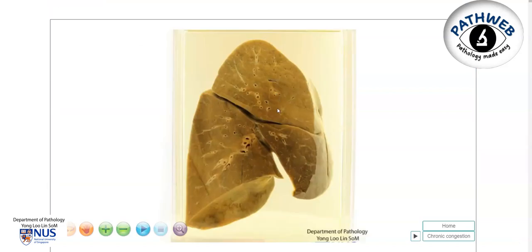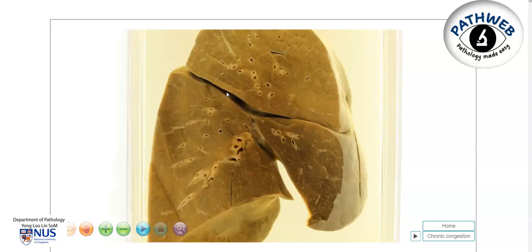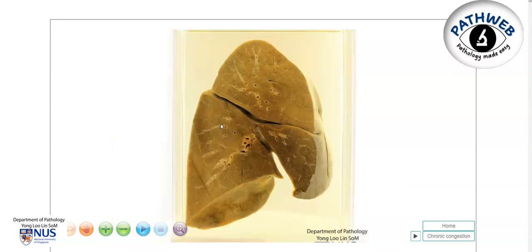In summary, this is a gross pathology specimen showing chronic venous congestion of the lung. We have diffuse brownish discoloration of the lung and we also have induration — stiffening or hardening — of the lung parenchyma. The most common cause of this is congestive heart failure. Thank you.